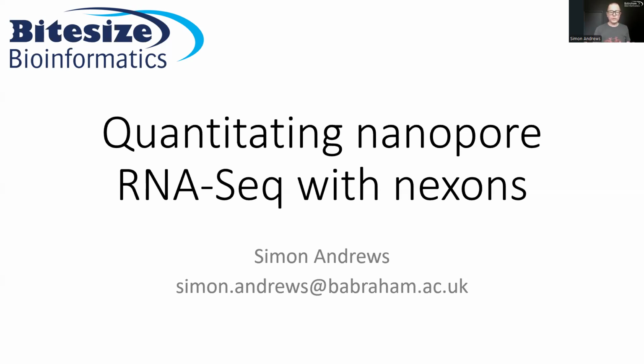Today, I'm going to talk to you about a bit of software that we developed actually some time ago, but underwent a fairly major rewrite recently. This is a program called Nexons, and it's a program for dealing with the problem of quantification and quality control of RNA-seq data performed with nanopore sequencers, which is a relatively new technique still, and one which is offering some advantages over more traditional ways of doing RNA-seq.